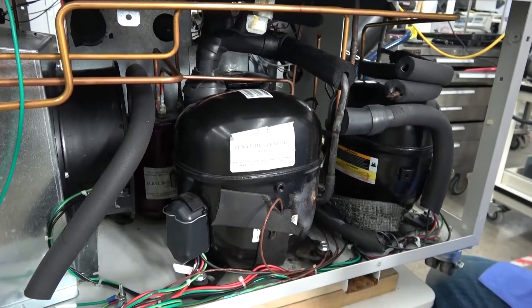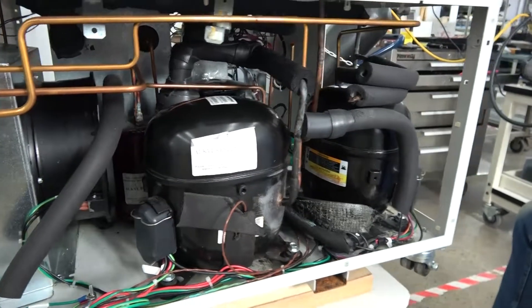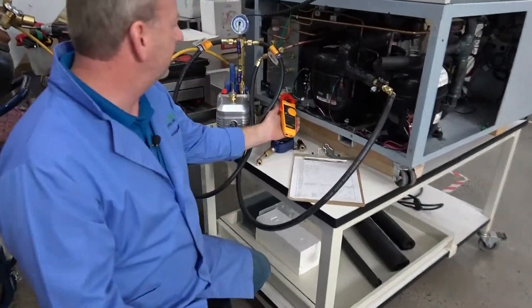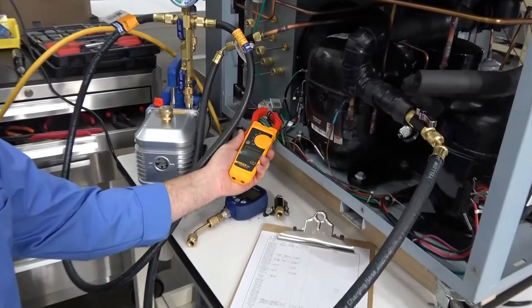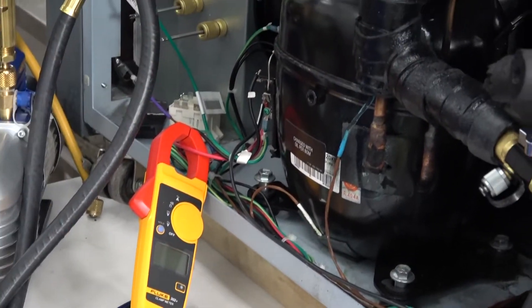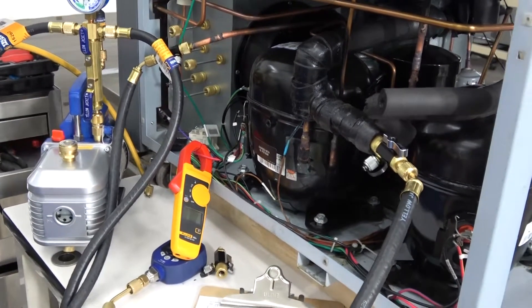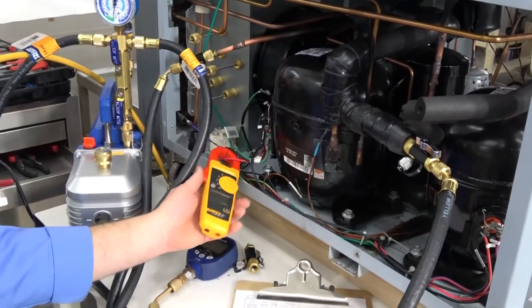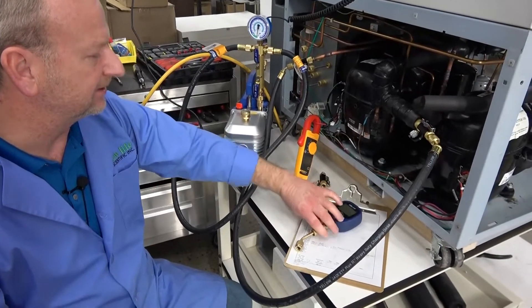Once we go past our simple senses, we use gauges like this to test the amp draws. What amp draws detect is whether a compressor is starting to fail because it's pulling too many amperes — the efficiency is breaking down. It might have bearings getting weak, or oil breaking down, causing inefficiency and high amp draws.